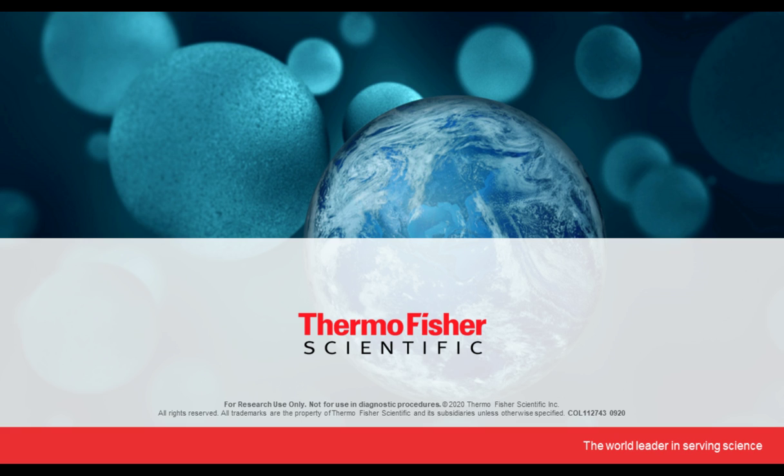Yeah, so I mean, that's a great question. So I will answer the second part first, right? For you to label a membrane, the only time you can label a membrane is before you add your blocking buffer to the membrane, or antibodies also, right? Because this is a probe that detects proteins. Blocking buffer has proteins, your antibodies are proteins. So it is going to detect everything if you try to use it after probing it with antibodies in your Western workflow per se. So that cannot be done. This has to be done before the blocking buffer step, right?